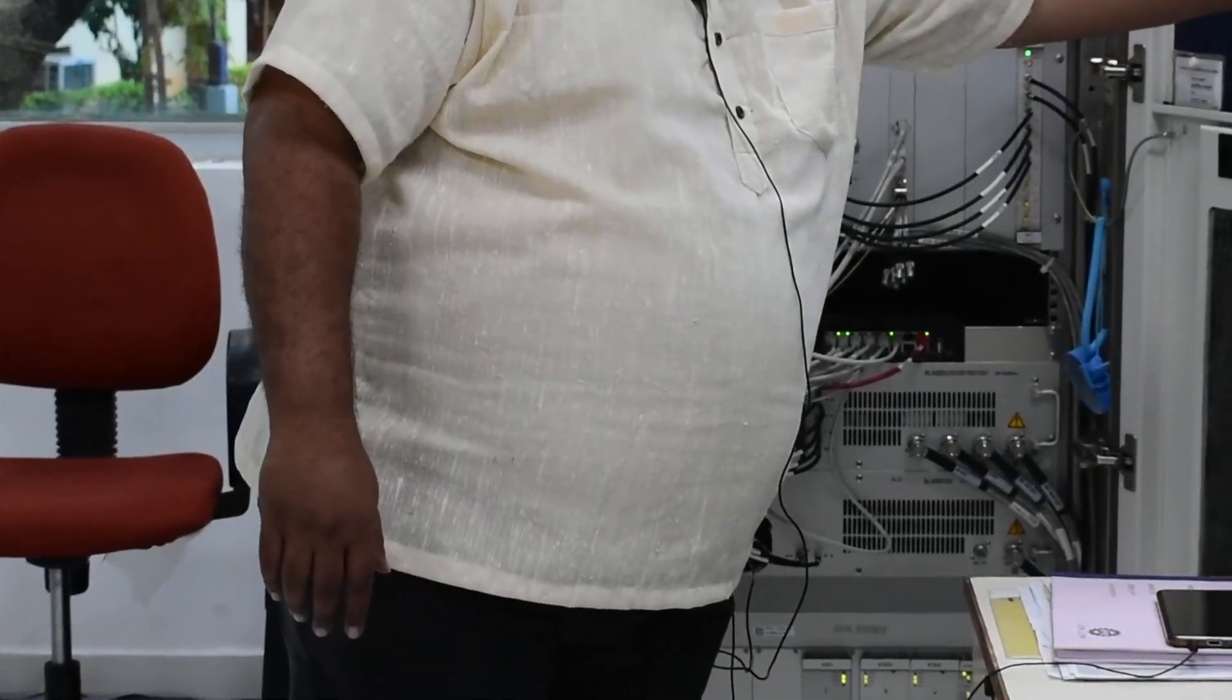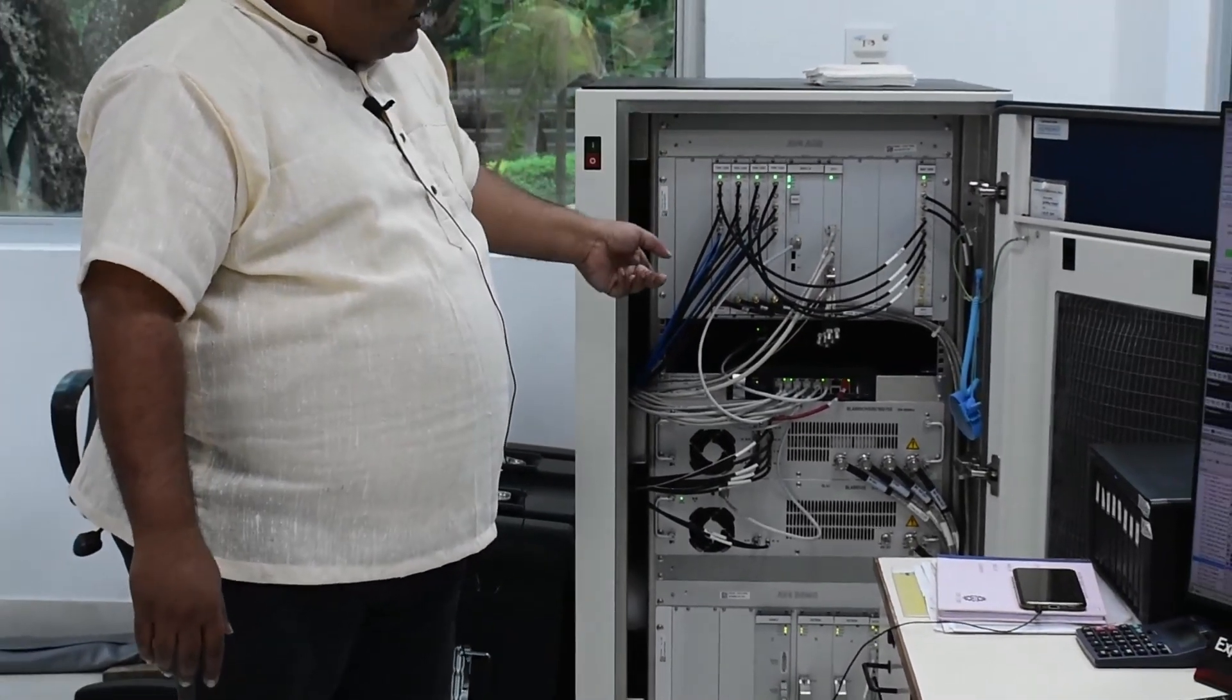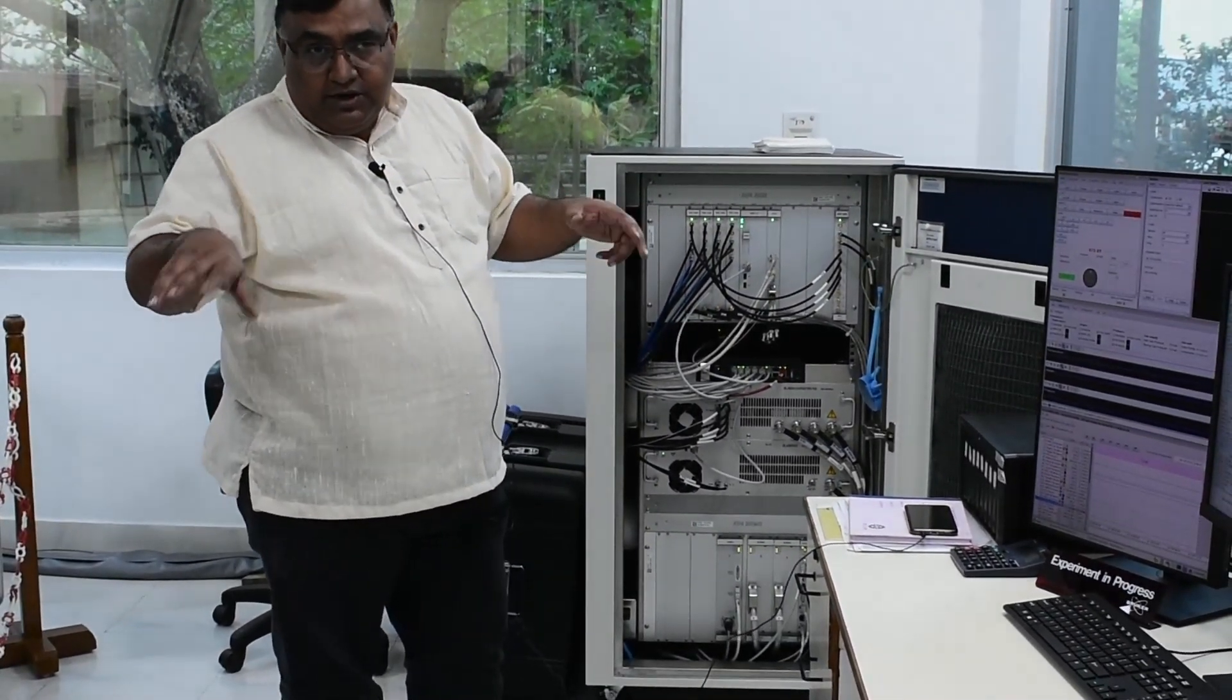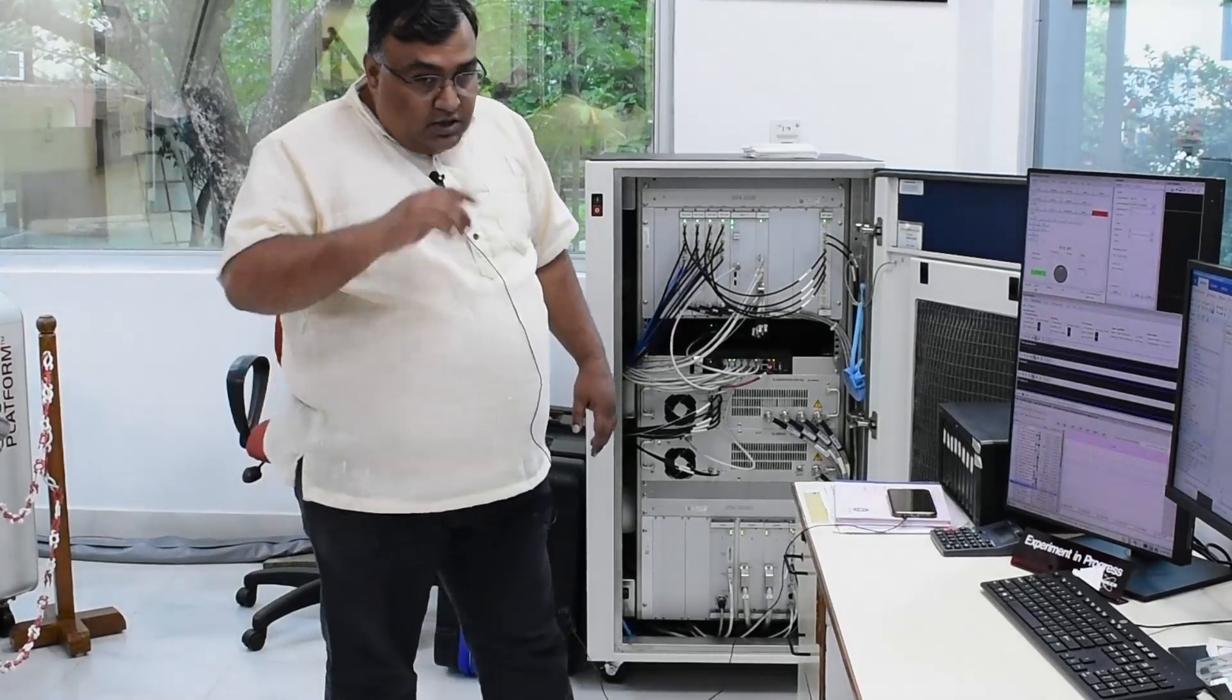The radio frequency pulse is generated here and not only generated, it needs to be amplified and there are many facets which we will discuss very soon.